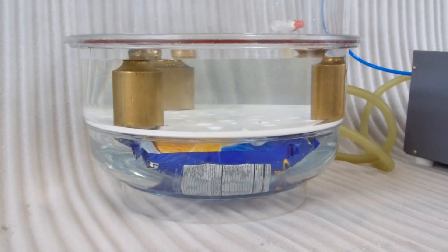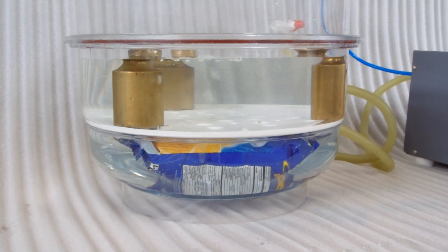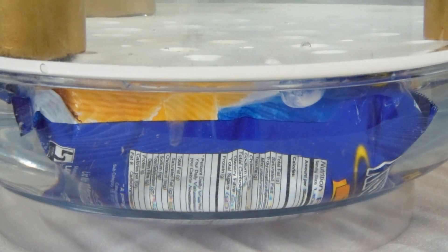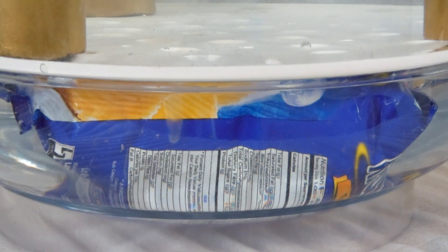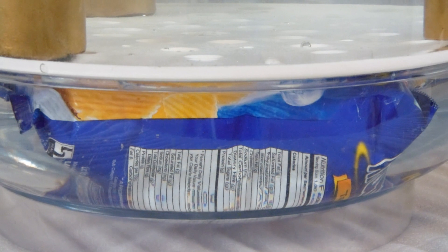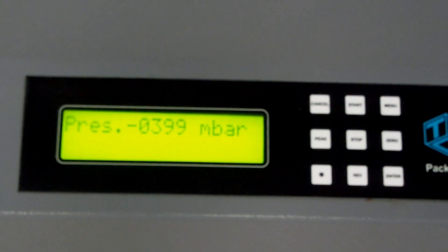If there is any leakage, a constant stream of air bubbles will start coming out from the leak point. Observe the leakage. If you do not find any air bubbles, then there is no leakage.